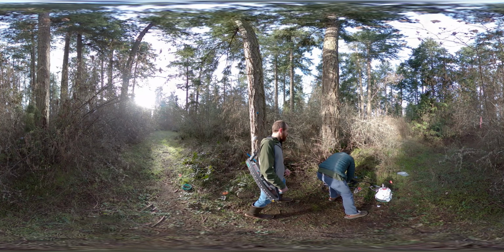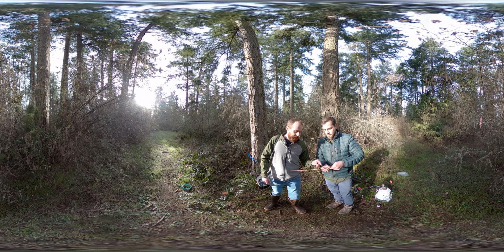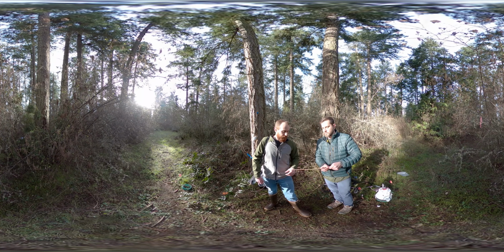A lot of people use tree cores traditionally to look at annual growth rates, so you can measure the width of each ring to get that annual growth rate. We're actually looking for either voids inside the tree or rotted out sections. So you see this dark orange section is kind of rotted out, and that could be an indicator of some microbial induced methane production through rotting of the wood.